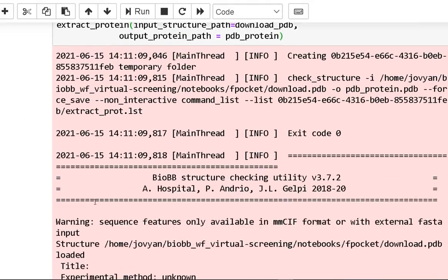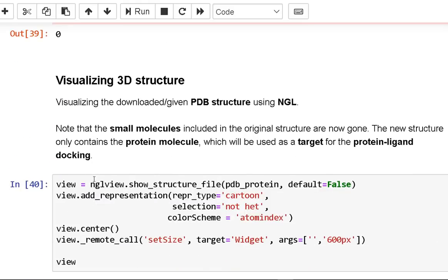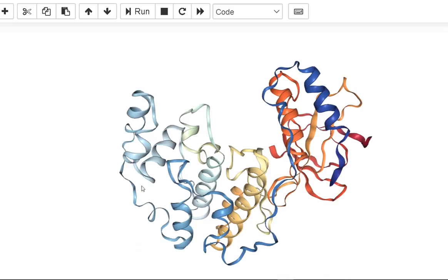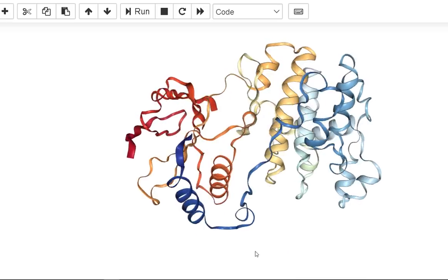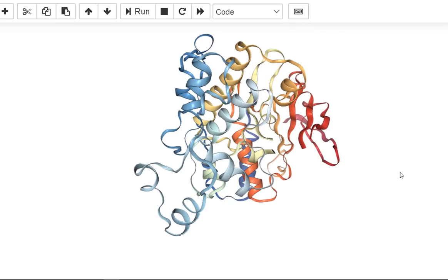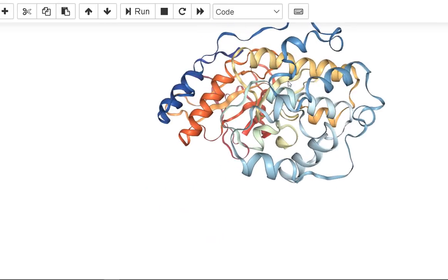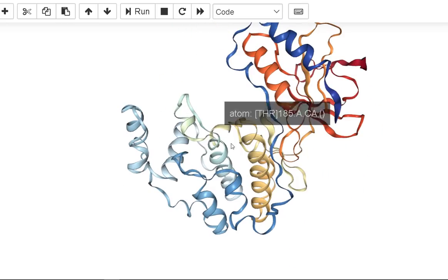Now let's visualize the downloaded PDB structure again. As we can see, the small molecules included in the original structure are now gone. The new structure contains only the protein molecule, which will be used as a target for protein-ligand docking.